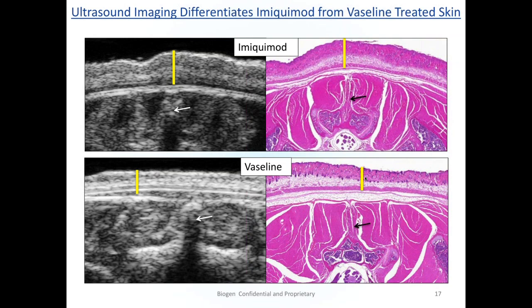But for contrast, there was confounding background in the skin layers. And for Doppler, it just wasn't measurable, it didn't really separate from the control groups. It just wasn't enough to really measure it. We were super excited about that though, but it didn't really pan out when we got down to doing the studies.